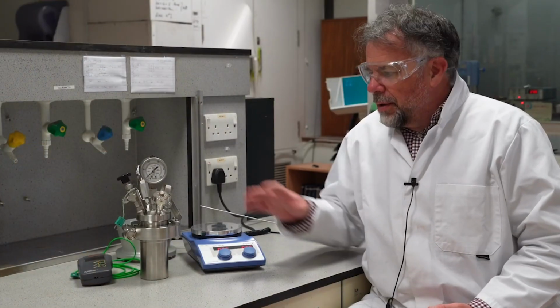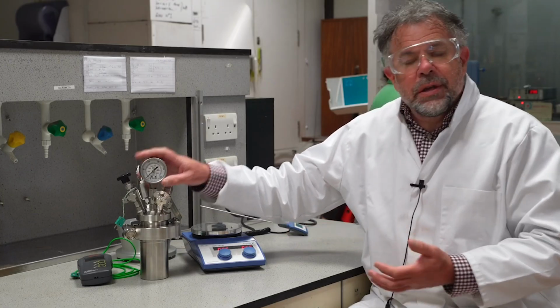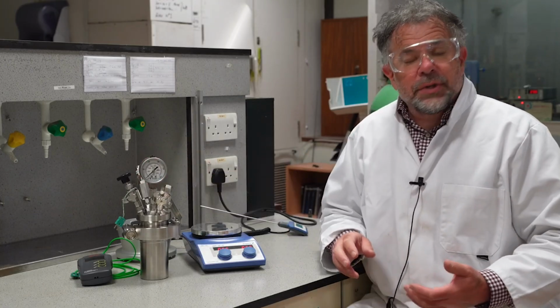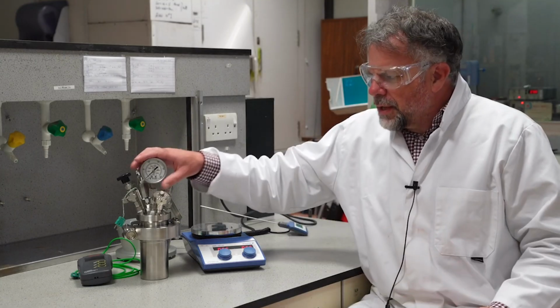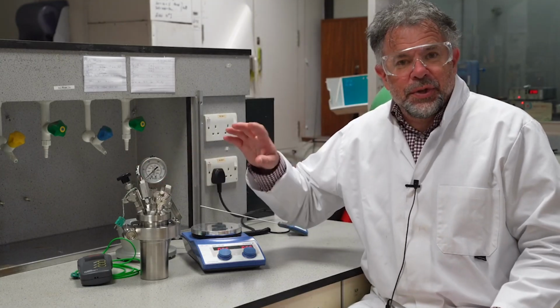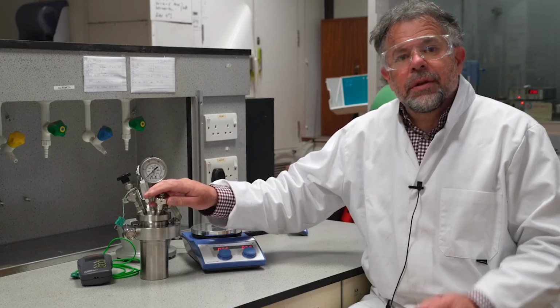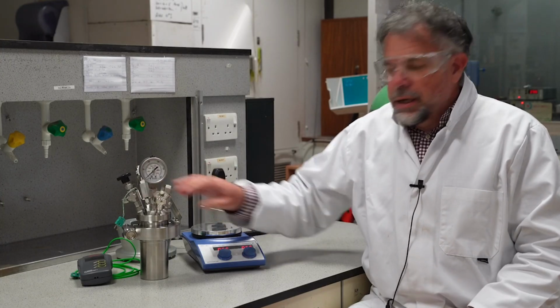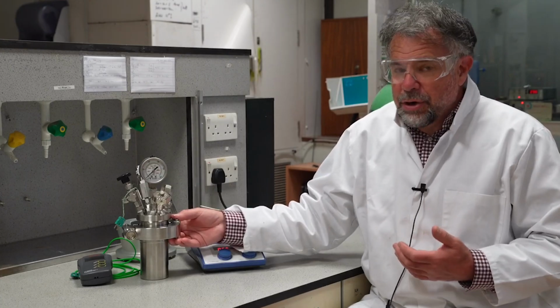I'd like to say a little bit about the difference between the out of the box PressureSyn and Steve's laboratory setup here and what they're using. PressureSyn has some of the same safety features. The critical key that's been explained already prevents you from opening this when it's under pressure.